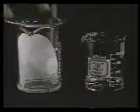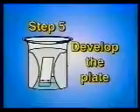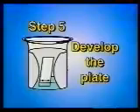Swirling the solvent onto the paper will help you do this. When the filter paper is completely wet, the developing tank is ready to use. With the sample spotted onto the plate and the TLC tank charged with solvent, it is time to carry out step 5, develop the plate.